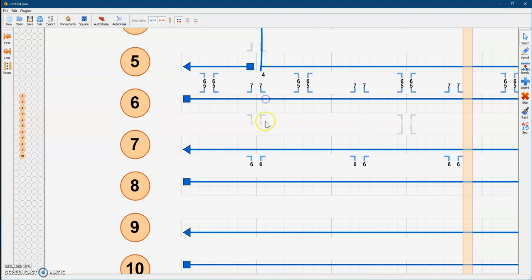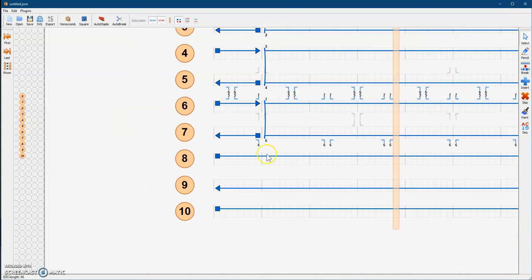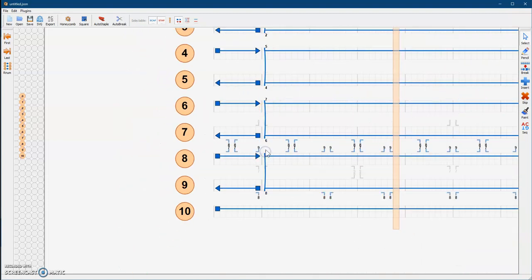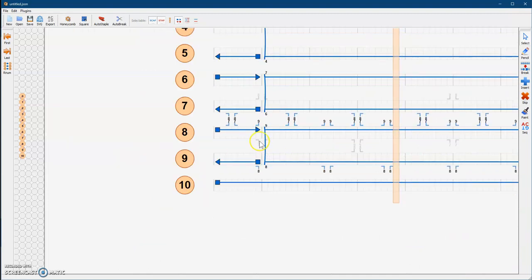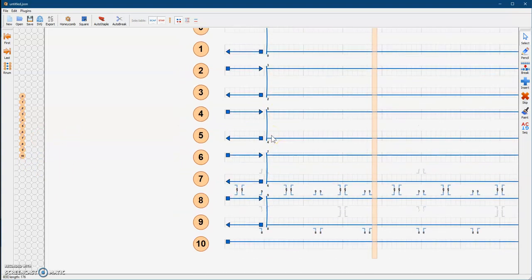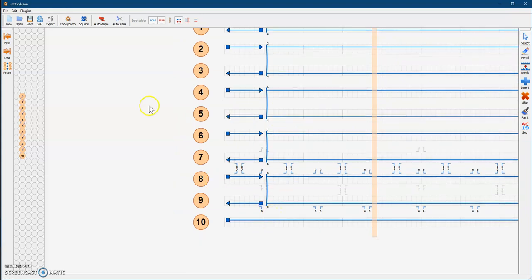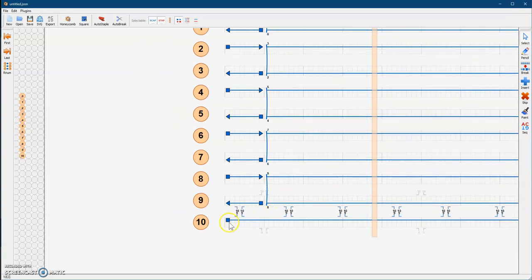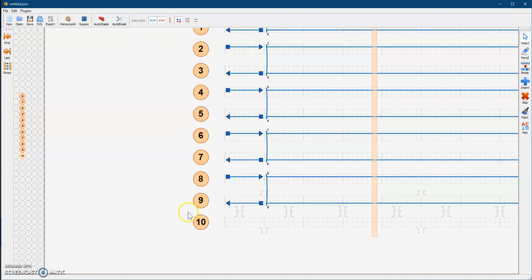We keep going down and keep doing this for the rest of the DNA structure. It looks like we don't need strand number 10 because it doesn't have another one to pair to. We could add another one, but for simplicity let's just delete it. We select the end here and just hit delete on your keyboard, and it's gone.